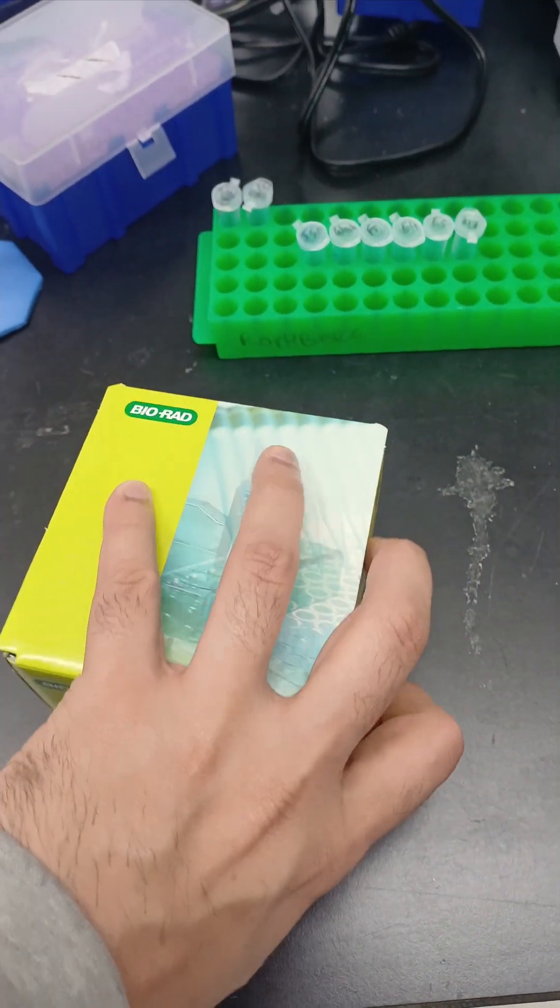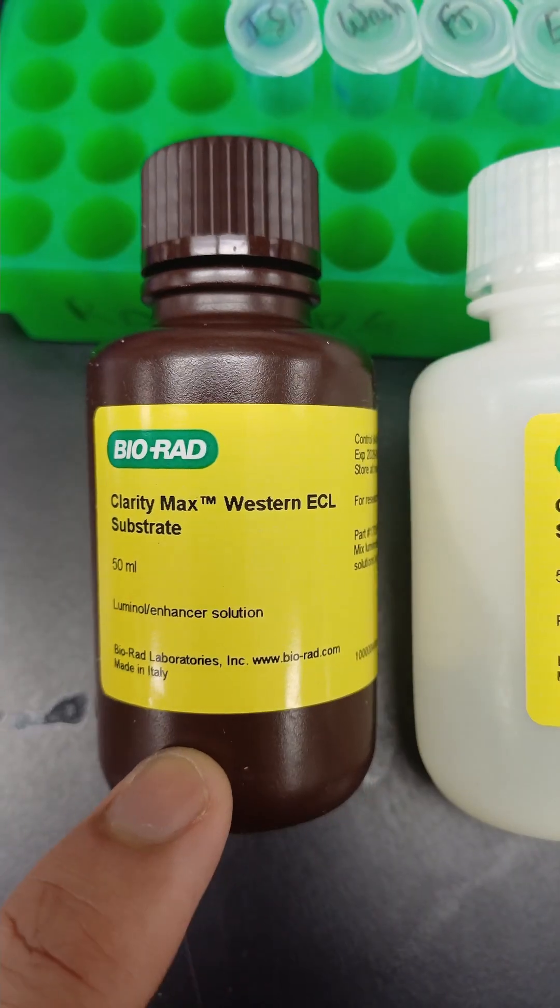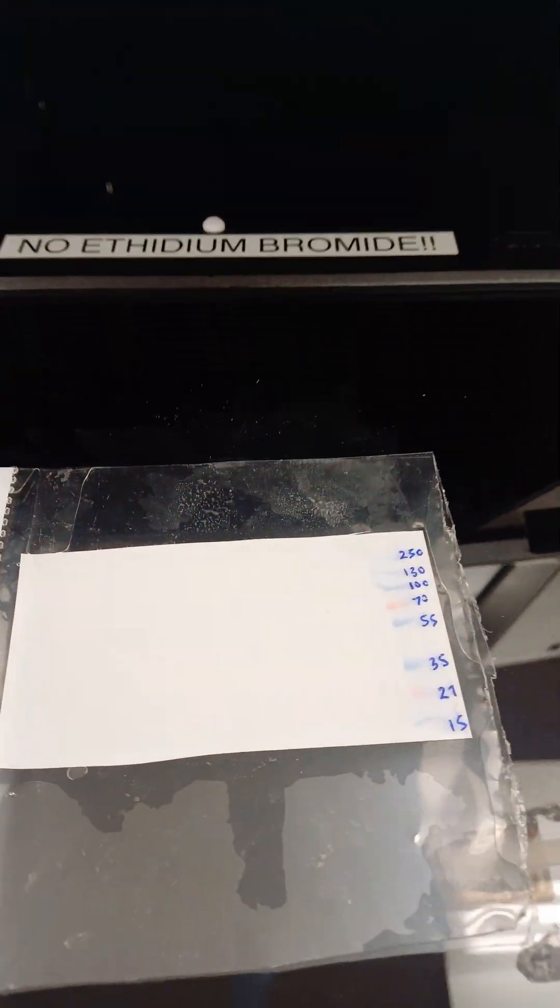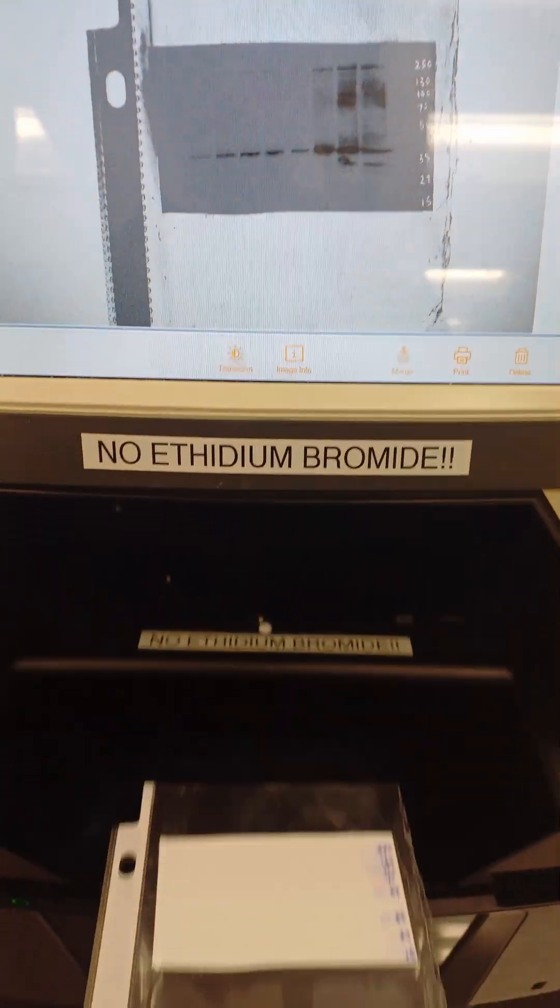Now to develop the blot, add the chemiluminescent reagent. Mix equal parts of these and pour over the blot under a chemidoc. Finally expose and capture the signal. And that's your western blot done right.